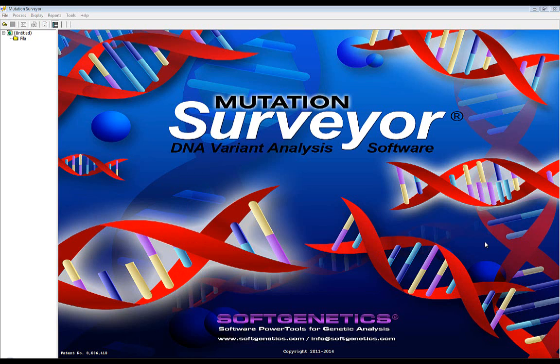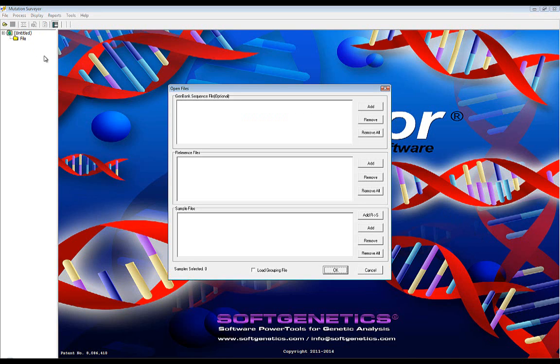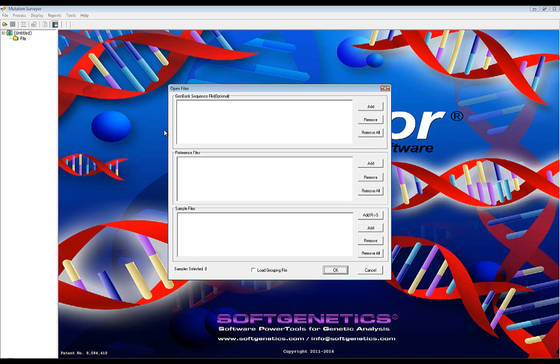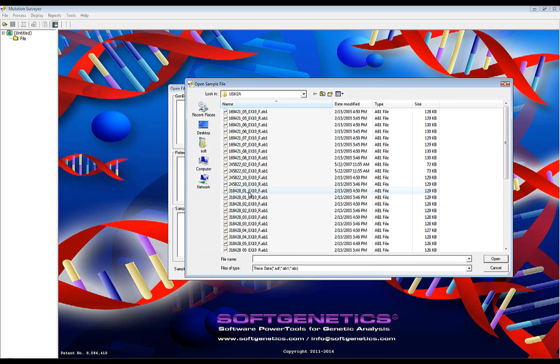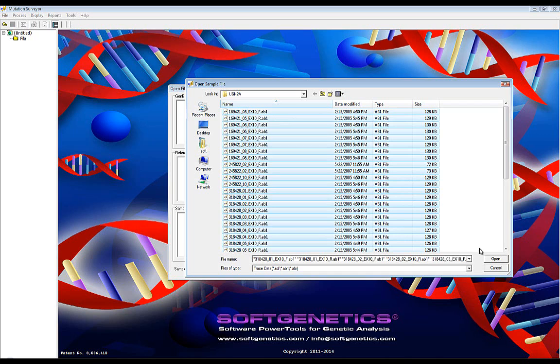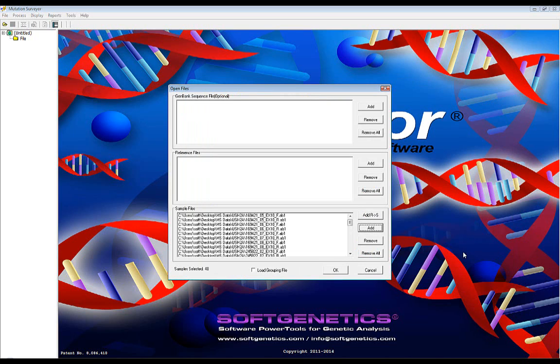Once your databases have been uploaded and selected, you may begin a project by loading your sample, reference, and GenBank files. It is important to mention that the database features of Mutation Surveyor are dependent on obtaining chromosome coordinates from the GenBank file. So, an NT or NC accession GenBank file must be loaded into the project. If you don't have either of these files, you may simply leave the GenBank pane blank like I have done here, load your sample files, and Mutation Surveyor will automatically download the correct file and obtain chromosome coordinates for you.